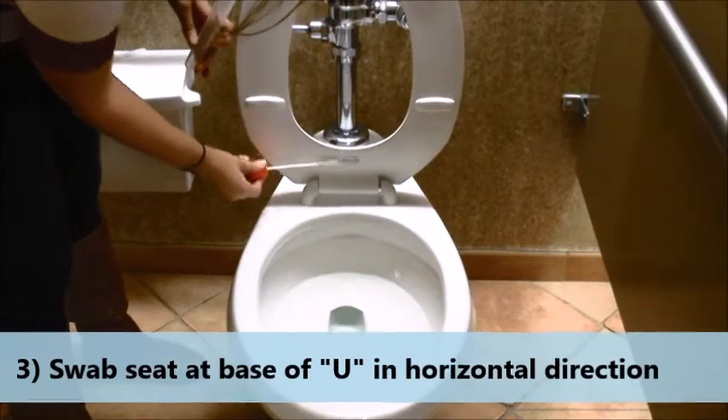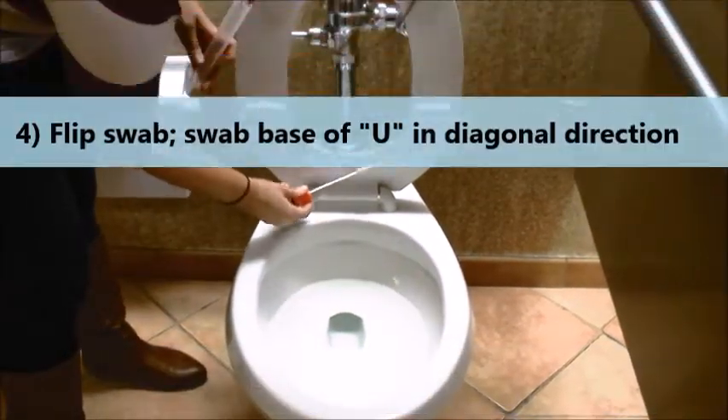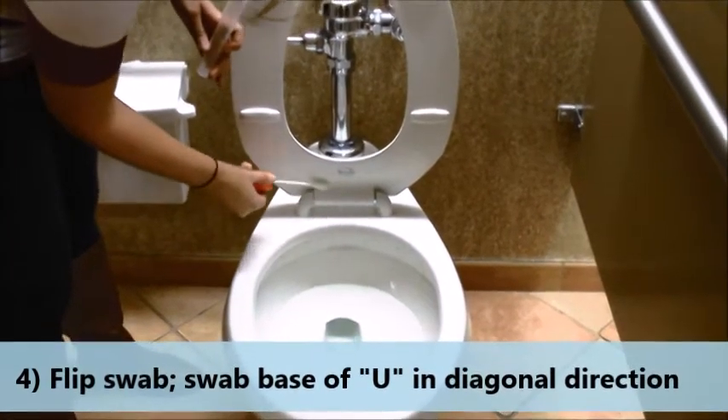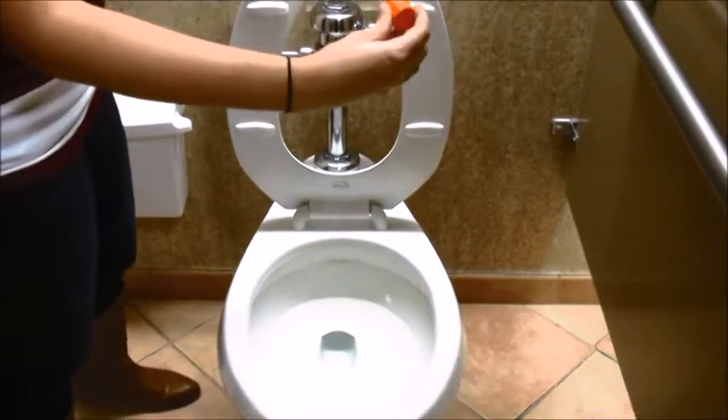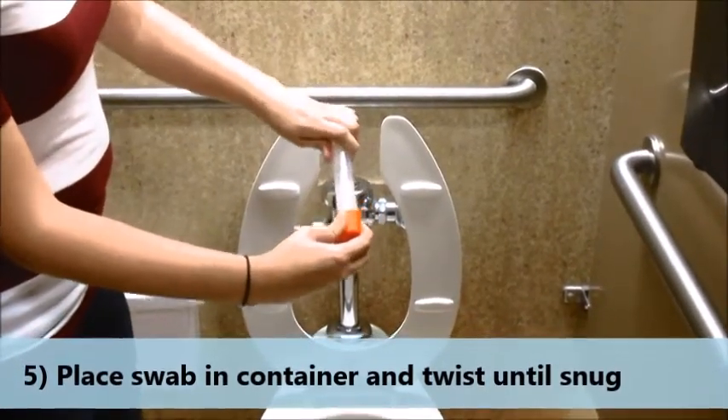Swab the base of the U of the toilet seat in the horizontal direction. Flip the swab over and swab the same location in the diagonal direction. Place the swab back into the container and twist the lid just until snug.